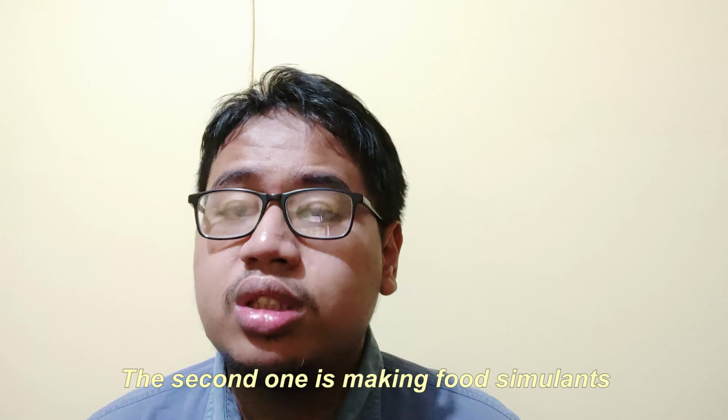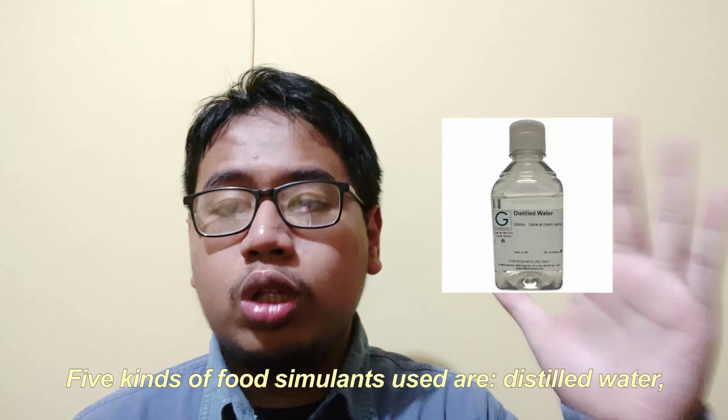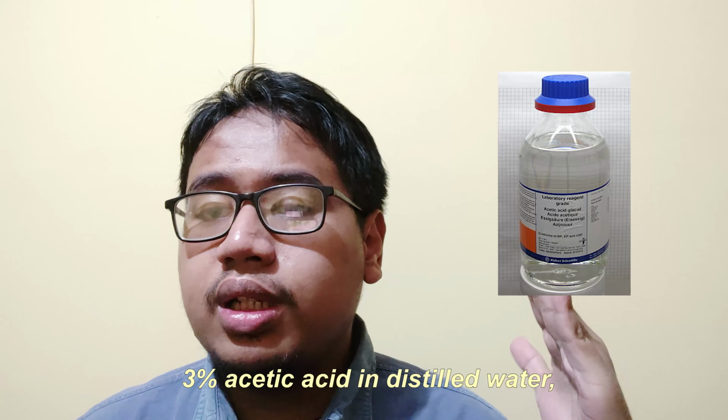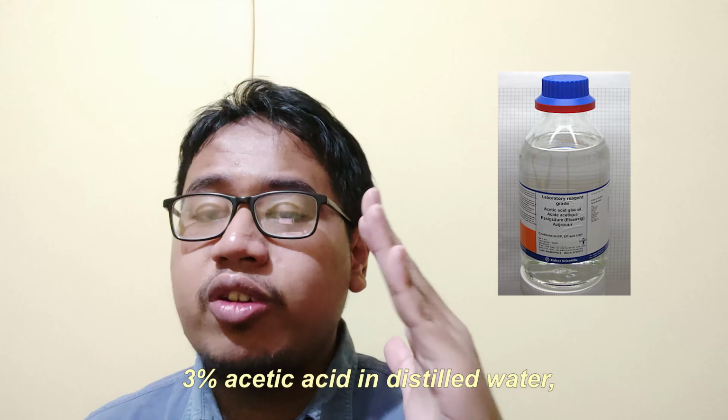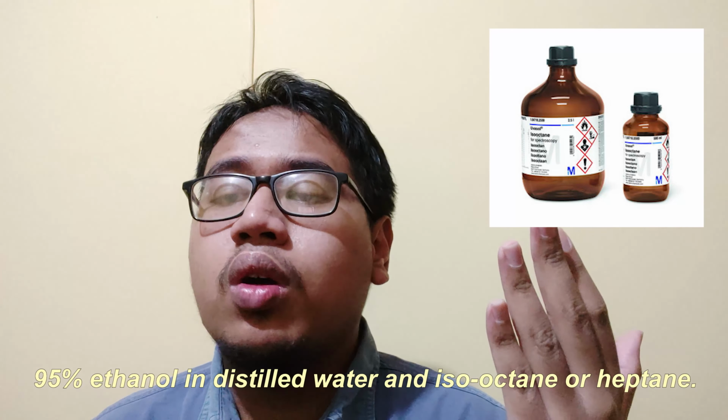And then the second one is making food simulants. The 5 kinds of food simulants are distilled water, 15% ethanol in distilled water, 3% acetic acid in distilled water, 95% ethanol in distilled water, and isooctane or heptane.